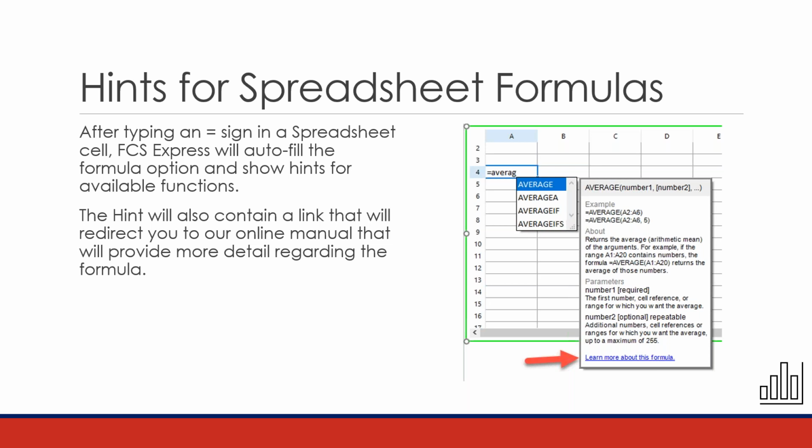So when we introduced the ability of the integrated spreadsheet in FCS Express, it was really a bit of a game changer for us. It really made things much more convenient for users that basically had to use one piece of software to analyze their data, and then use something like Excel to report their data. The integrated spreadsheet gave them the ability to not only analyze, but also report data at the same time within that layout, much like they would have done in Excel.